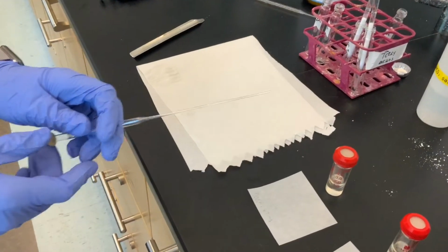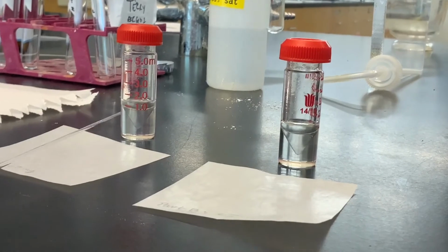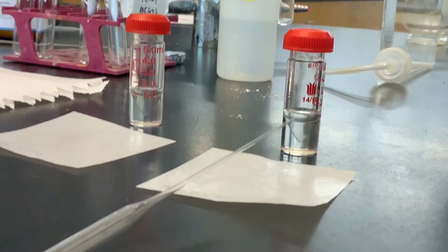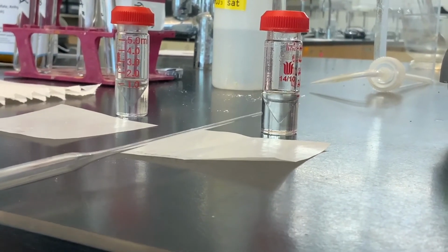All right, so we've partitioned part A, aqueous layer on top, methylene chloride layer on the bottom. Part B, we've got the saturated bicarbonate layer on top, and then of course the organic methylene chloride layer.